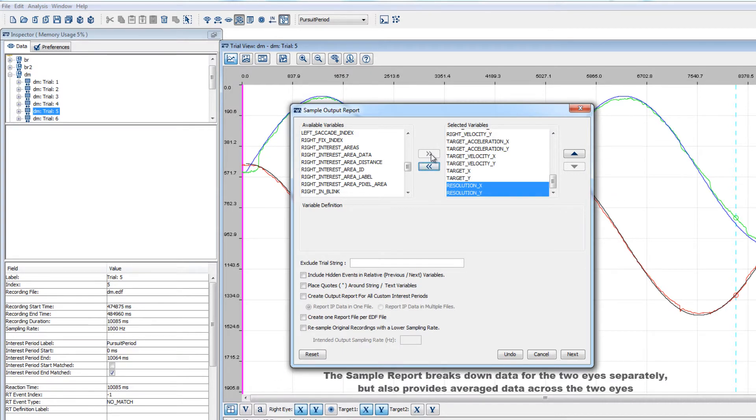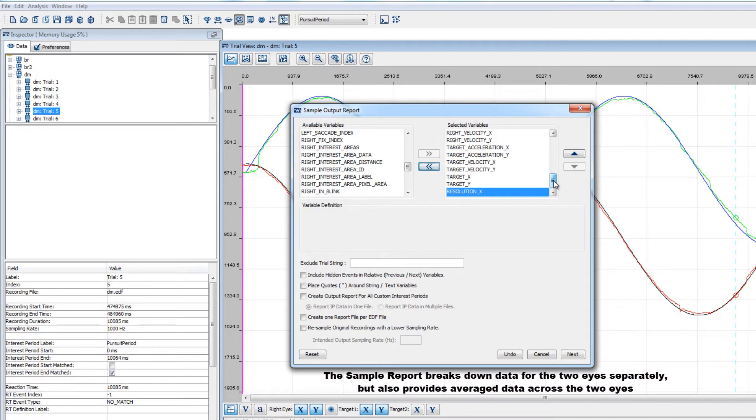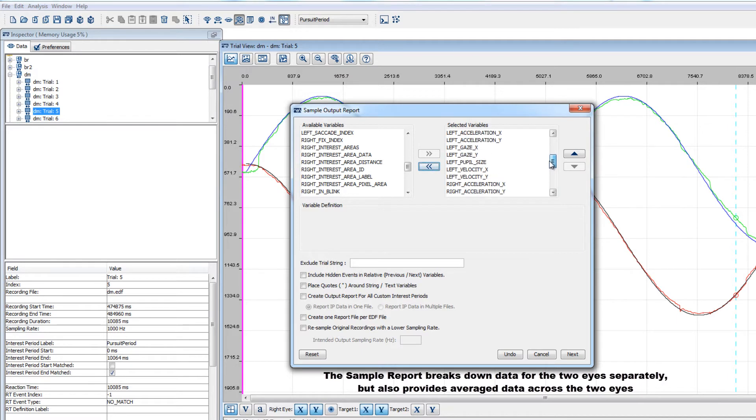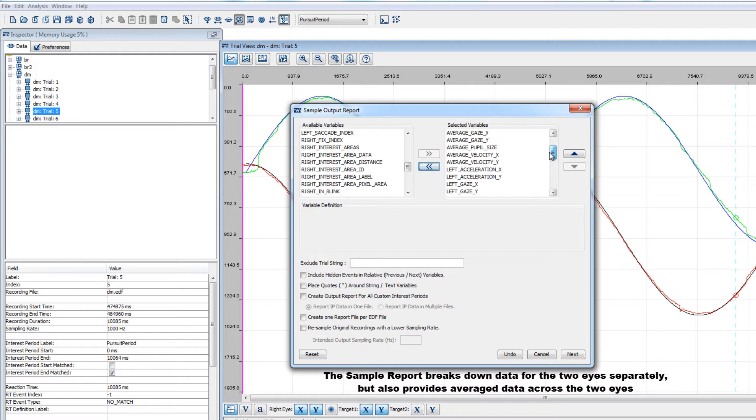Note, the sample report breaks down the data for the two eyes separately. So, data from the right eye will be represented by variables with right in the label, and data from the left eye will be represented by variables with left in the label. There are variables that provide average data across the two eyes as well, which can be useful for binocular recordings.